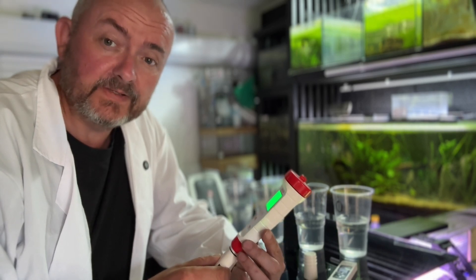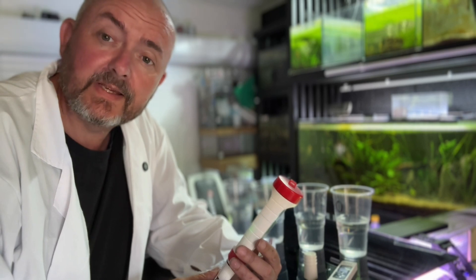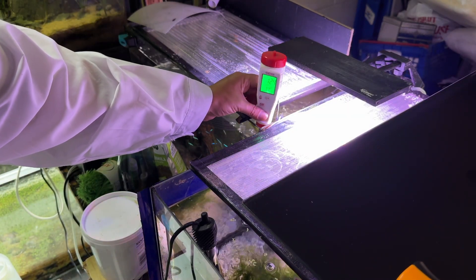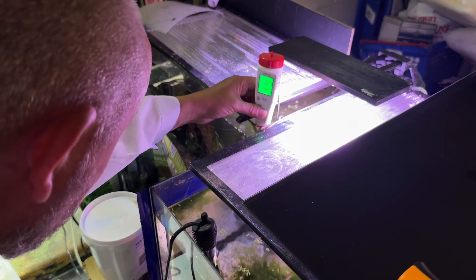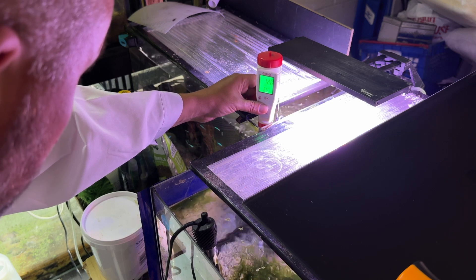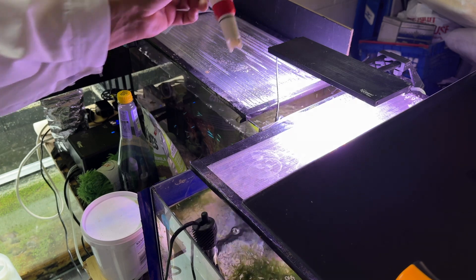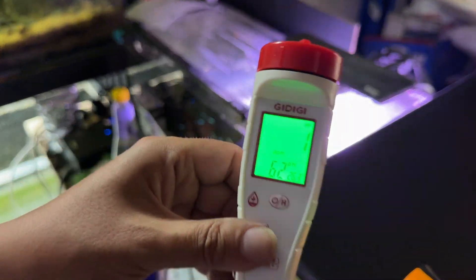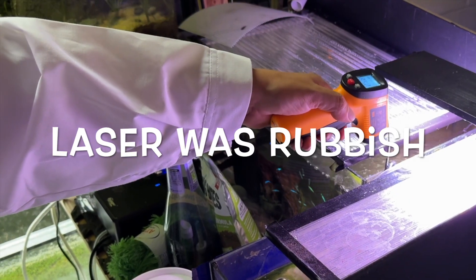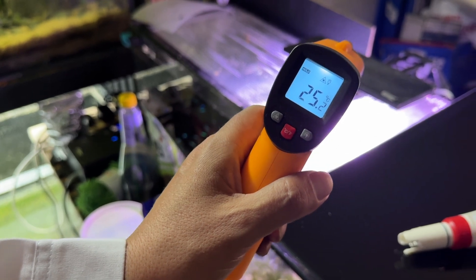The probe itself was really good — very accurate out of the box. It also has a temperature gauge on it, which we'll test now. I can only test it against a thermometer, hopefully the thermometer is right. We'll try it in this tank here. It's saying 26.1°C, 6.6 pH, and 98 TDS. Temperature: 26.3°C. Let's try the laser. Now that's saying 25.3 — 25.2. So that is about one degree out.